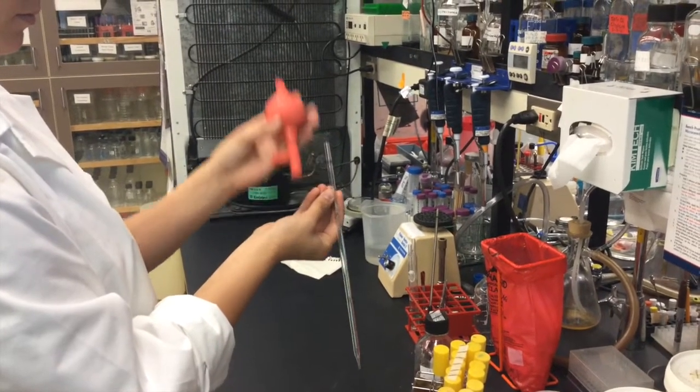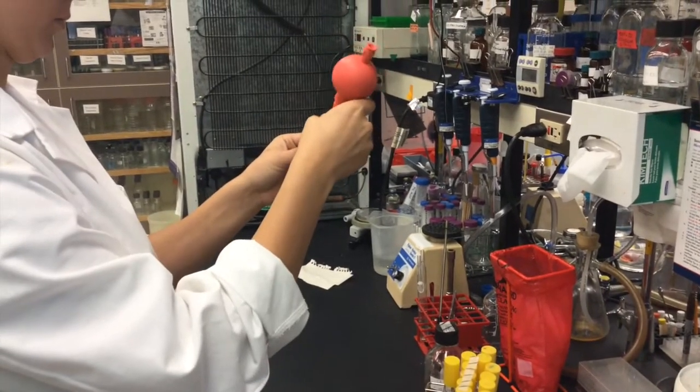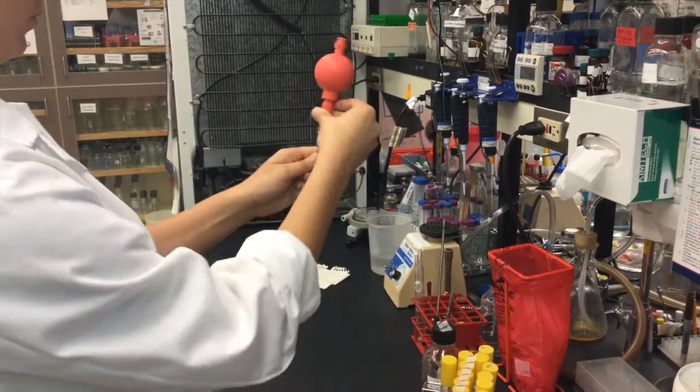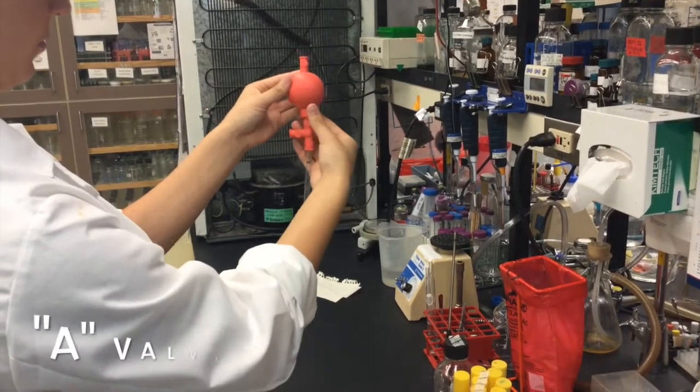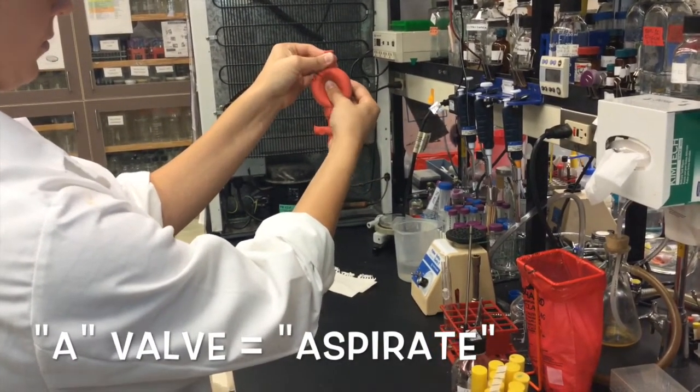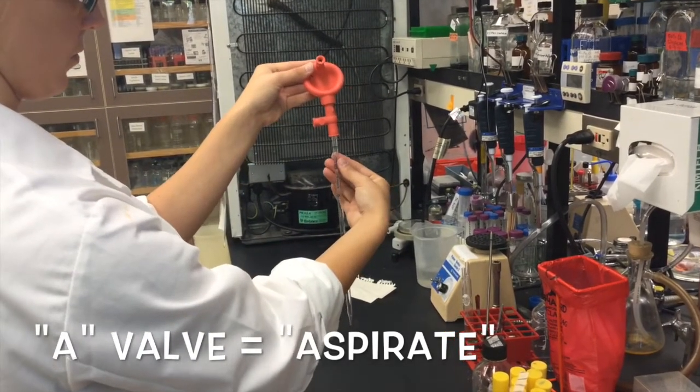In order to transfer this fluid, you must add the pipette bulb to the top of the pipette. Remove the air from the bulb by pressing the A valve and squeezing the bulb at the same time. This will create pressure so that we can suck up our liquid.